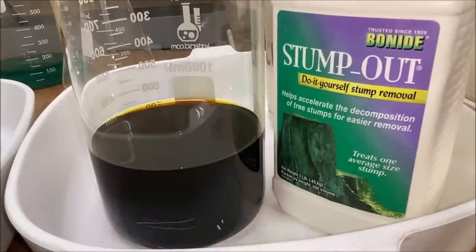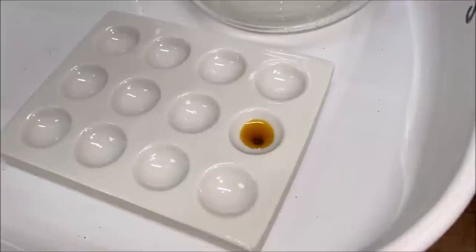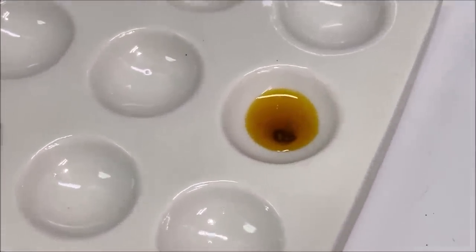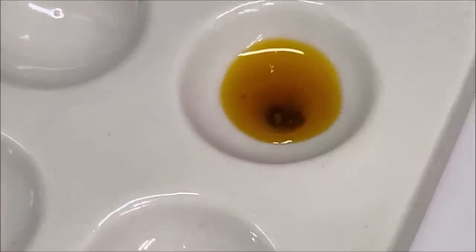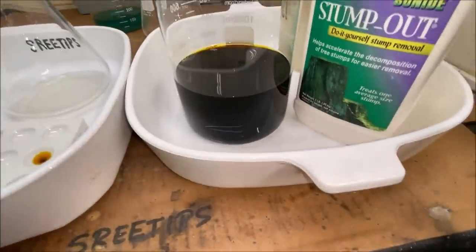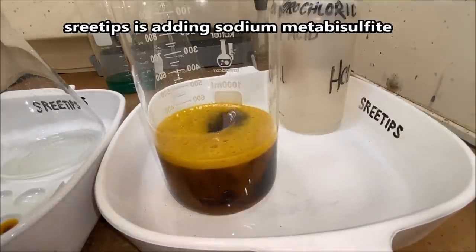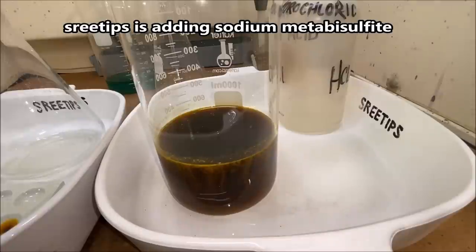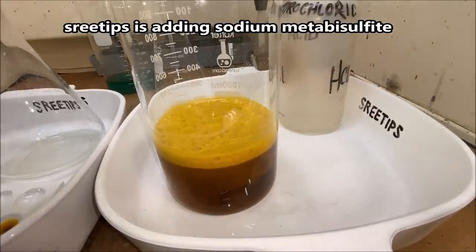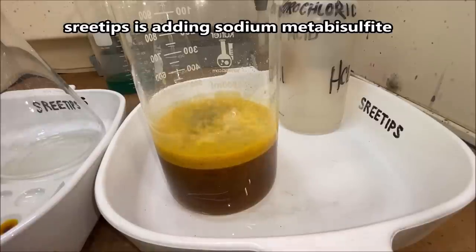I don't know how much gold I have in solution. I know I have gold in solution because I've got that test right there. And that brown cloud around that ferrous sulfate means gold in solution. So what we're gonna try to do, I've done this in the past when I've done my stock pot, is add some to this solution. I don't know how much to add because I don't know how much gold's in there, but I'm just gonna put in a couple spoons. And we're gonna try to precipitate out the gold out of this solution. Probably gonna get a little bit of platinum group metals coming down with it also. That should do it.